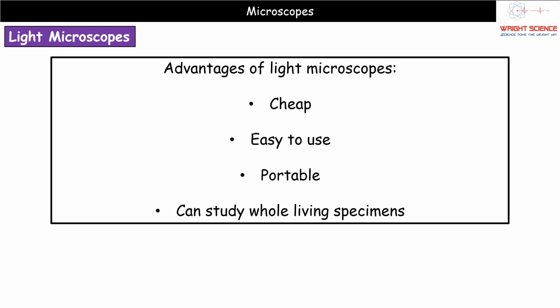And if you have the opportunity to do some of this biology field work, then particularly if you get involved in any of these expeditions that go on overseas that you can do, you will be using a light microscope in the depths of a cloud forest somewhere in Honduras, for example. We can also study whole living specimens. Things don't have to be dead when we're using a light microscope, so that's really beneficial to us as well.